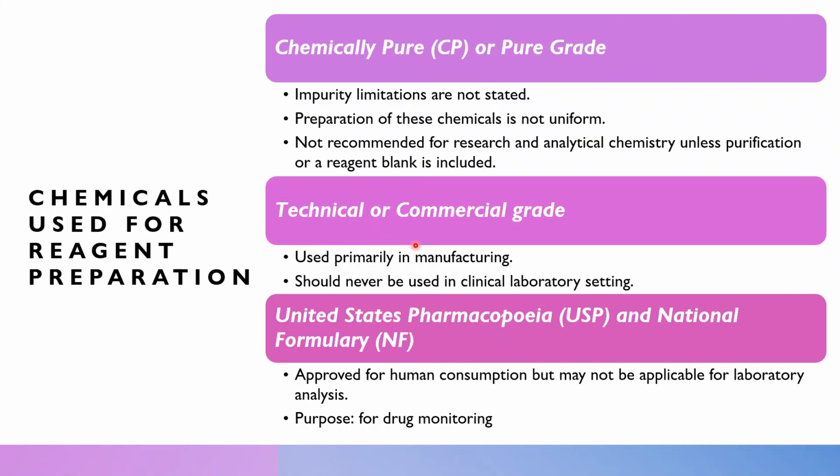While lastly, for technical or commercial grade reagents, they're used primarily in manufacturing and also should never be used in a clinical laboratory setting.